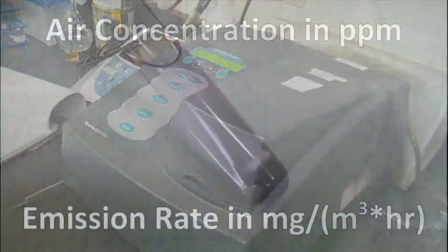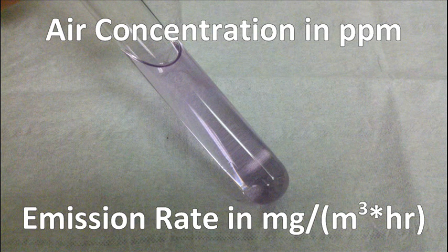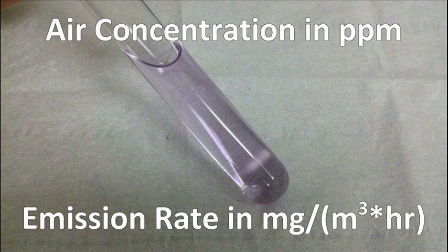The results of this test method are expressed as the formaldehyde concentration in air or emission rate or both. It should be noted that these results are only relevant to the specific air exchange rate and loading ratio used.